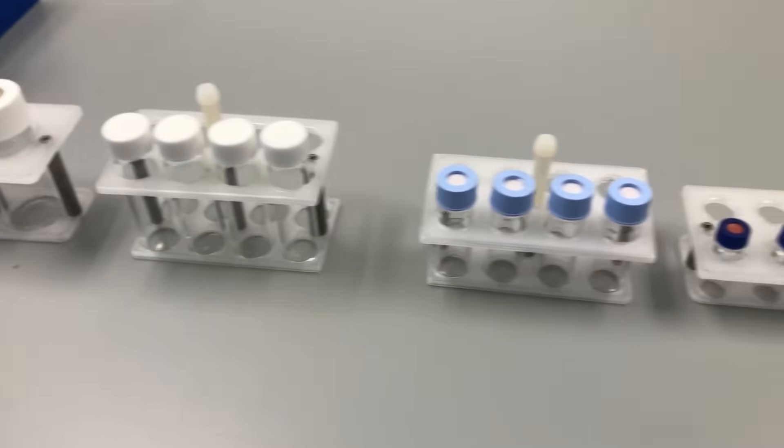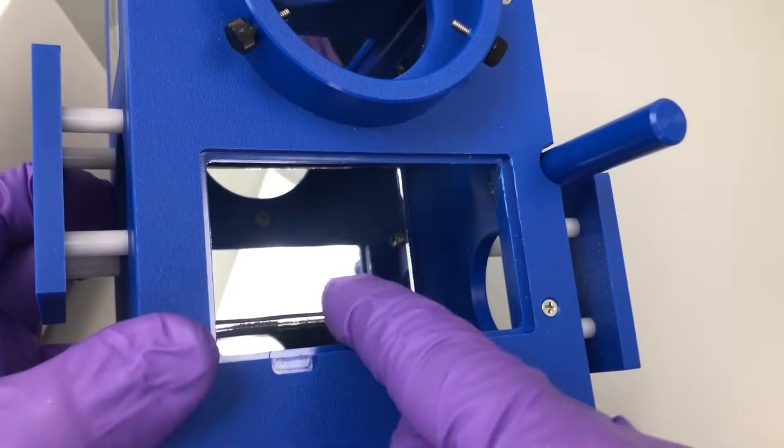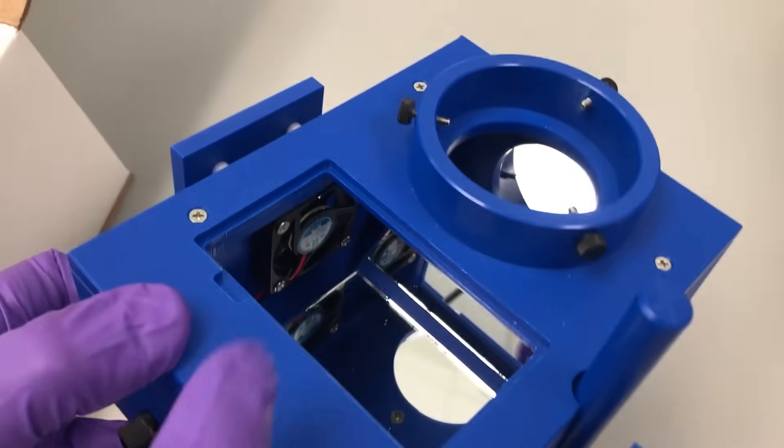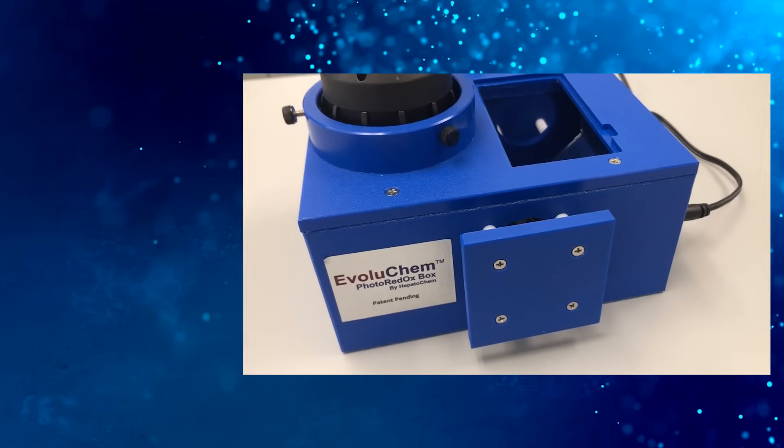Designed to accommodate a wide array of vial sizes and stirring plates, the photoredox box has an innovative and unique reaction chamber geometry for maximum light exposure and a built-in fan to keep reactions at room temperature.